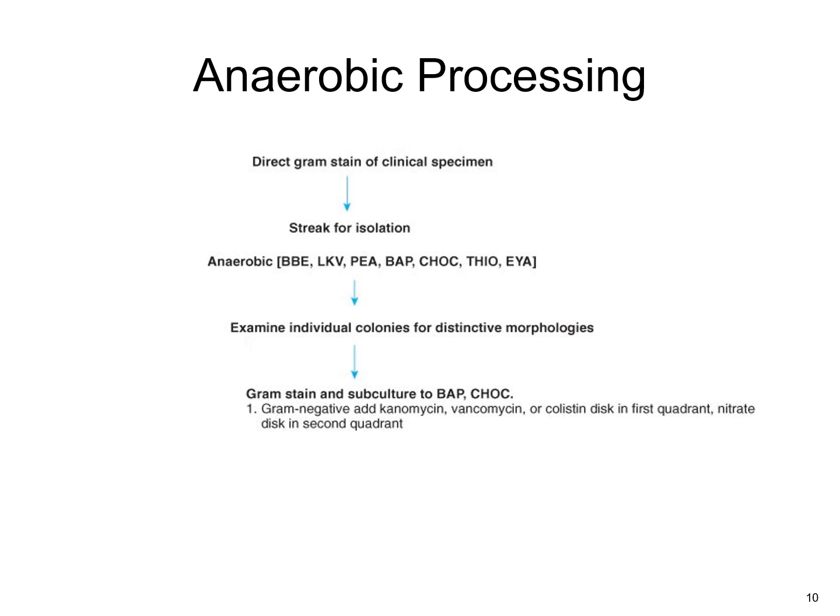And then after you've set that culture up and you've let it incubate, usually 48 hours, then you would examine those anaerobic cultures. But typically when you set up an anaerobic, you're also going to do an aerobic, so those would be reviewed the next day.